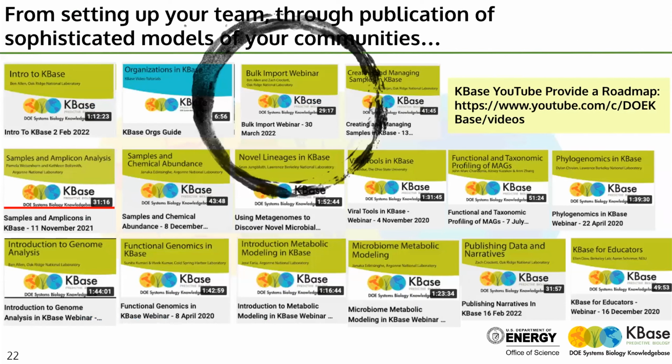Now, of course, we had a lot of data, and it can be very painful to upload data into a system. And so the team has worked very hard over the past couple of years to give you the ability to upload large numbers of data files in one fell swoop. Now, of course, because KBase is a knowledge base, we ask you to do things you might not be asked to do in other systems. We really do want you to say what your samples are, what your measurements are, and how they work. That does put a little bit of a bar on things, but the value you get back from that is extreme.